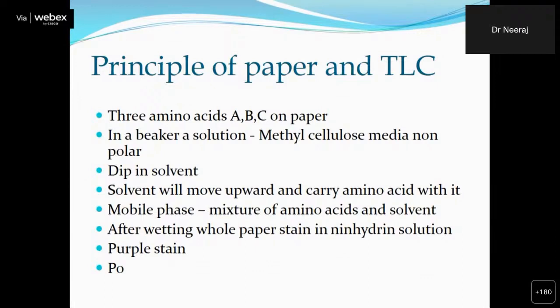Then the solvent will move upward because of capillary action, and by its movement it tries to carry the amino acids with it.